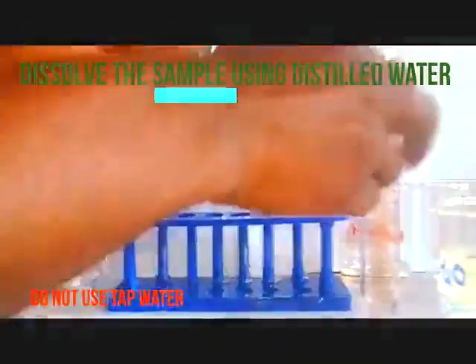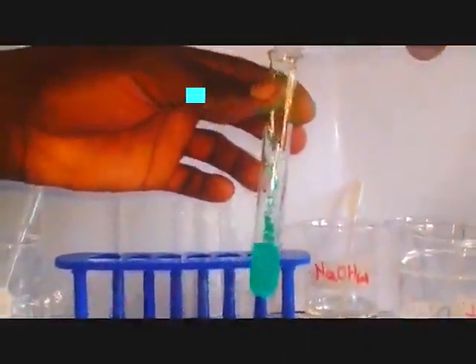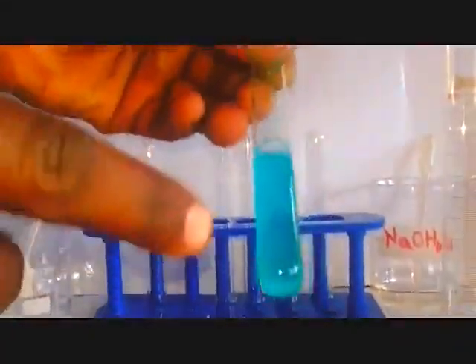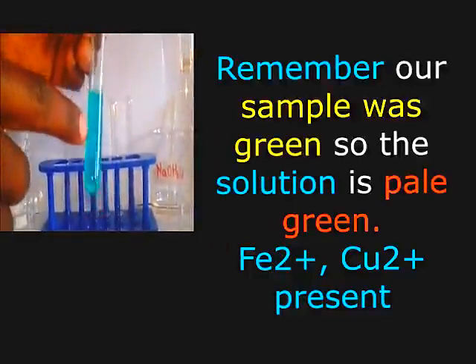After that, we add water. Don't just add tap water, we add distilled water. You shake the sample so that it dissolves thoroughly, if it is to dissolve. So as you can see, it is dissolving. So it is soluble, forming a pale green solution, as you can see here.